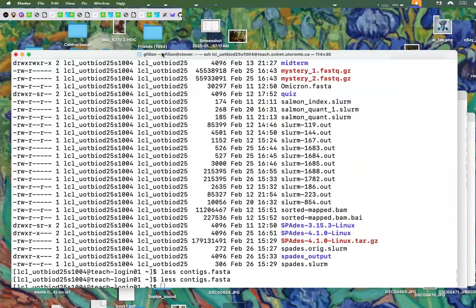So this is the strategy that you can use in order to answer those questions for the third part of the midterm. Are there any questions, things you'd like me to show again or that you did not follow with this demonstration? Okay, no, then I'm stopping the recording here.